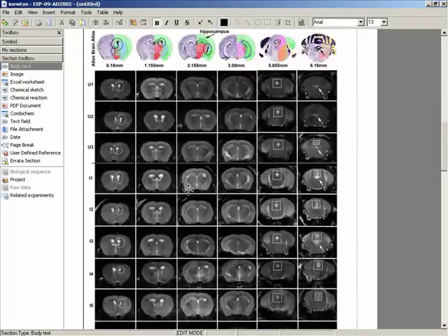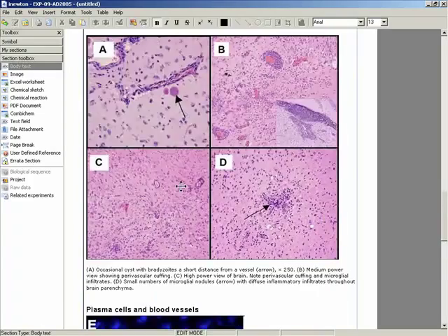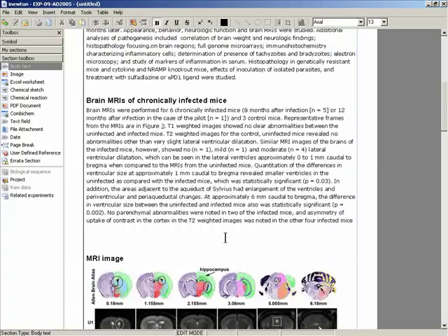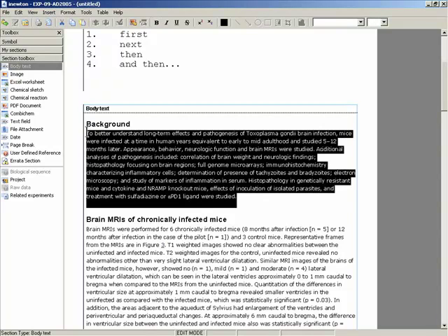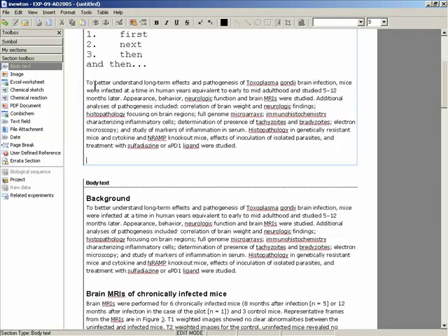different fonts, images, etc. Now it's much better to have all this in separate sections, so each of these paragraphs should really be in a separate section rather than in one large section, because with iLabber, if you make a change in a section, then the whole section is sent to our database, so with small sections less information needs to be transferred. We can copy and paste, so here we are copying text from one section into another section.